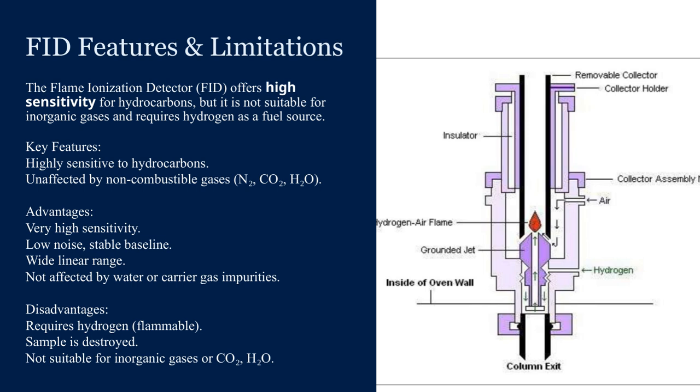Also, keep in mind that the sample is actually destroyed during the detection process, so it's a destructive technique. Importantly, the FID is not suitable for inorganic gases or for measuring carbon dioxide and water vapor. This makes it ideal specifically for hydrocarbons, but less versatile for other types of gases.